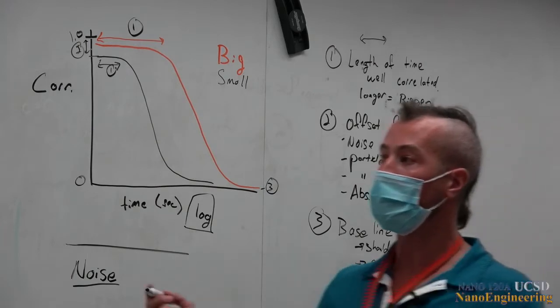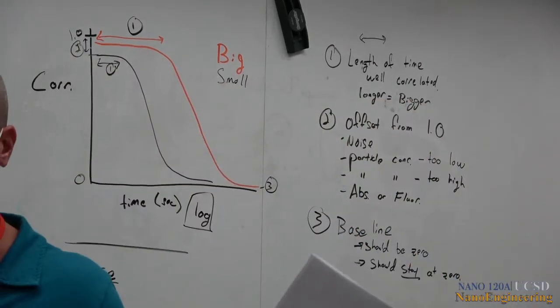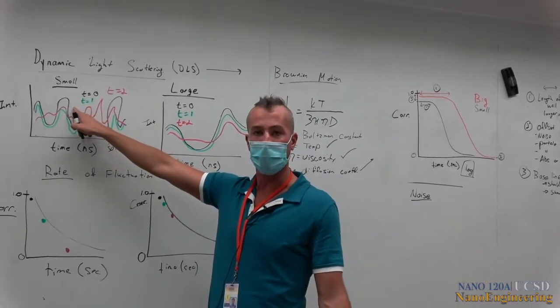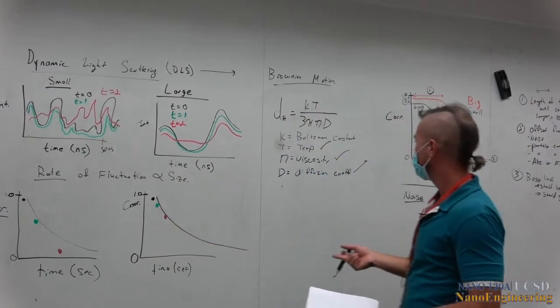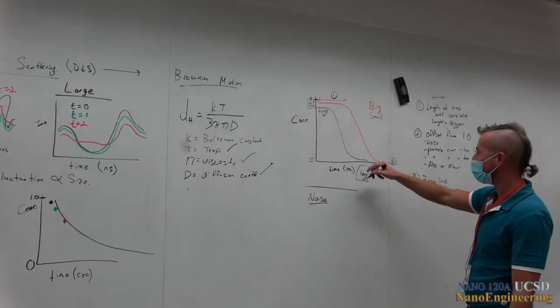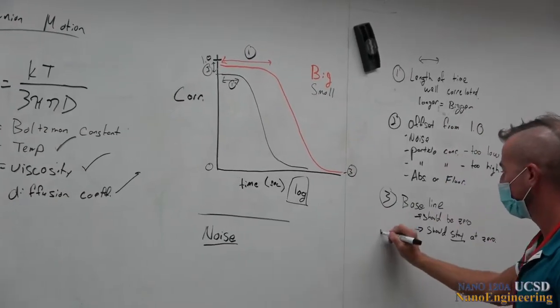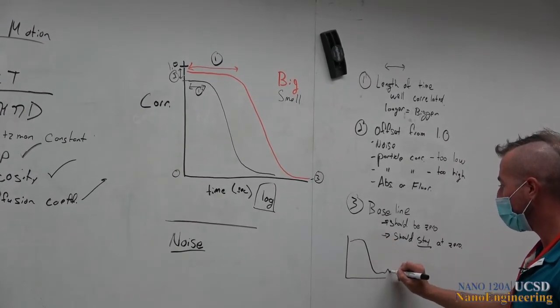Because there's no possible way that the 100 billion particles you have in your system are ever going to go back to the black curve at t equals 0, right? But what you will sometimes see is that it will stay elevated and it'll wobble.